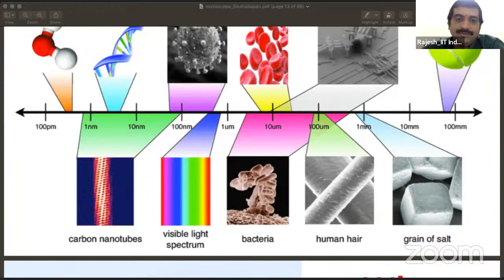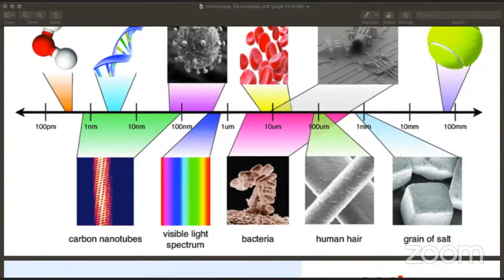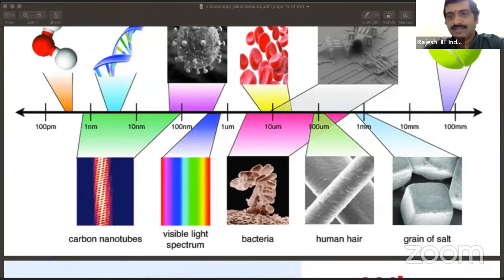Okay, any other questions? I think there were some on the chat. One question was about this alpha. That is the angle at which the light falls. The term there is called numerical aperture. This is a common formula: the angle with the normal, how far the lens is. That is the angle, the numerical aperture that is there.